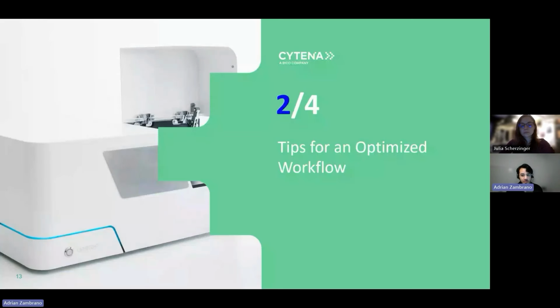So now in part 2, we want to provide you with tips on how to optimize cell recovery. Before I go into the specific details, I want to tell you that all the tests described here were carried out with 293F cells. These are from Thermo Fisher. We believe this is a good example of a typical HEK 293 derived suspension cell line that is often used by our customers. But some of these recommendations could also be extended to similar cell lines. I also want to make sure that you understand you could do more exhaustive testing in addition to what I will show you.